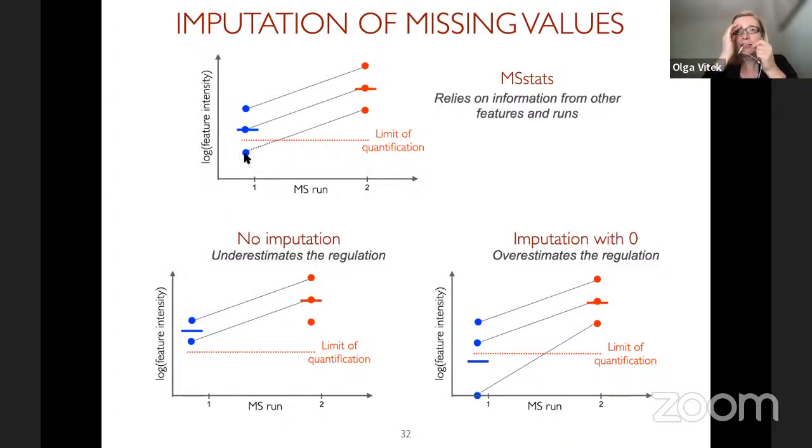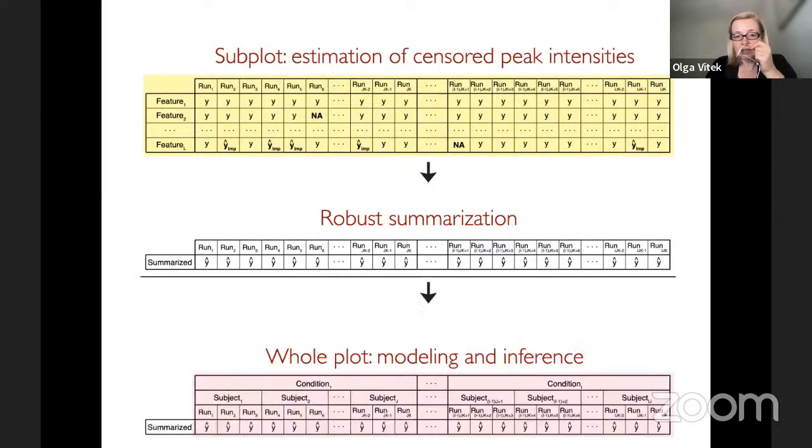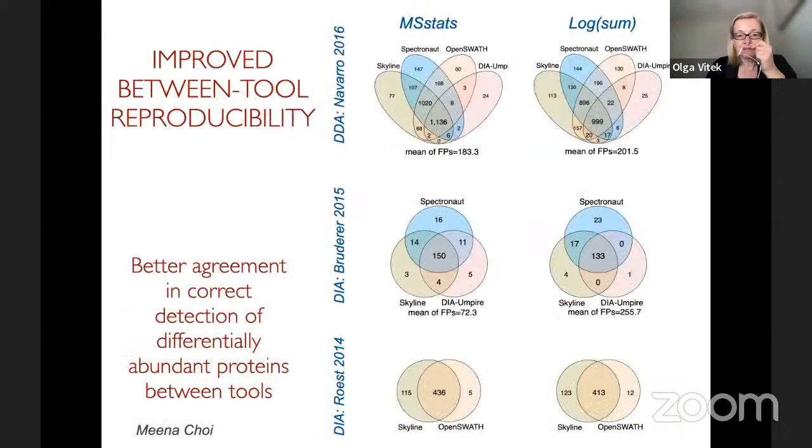As I was saying earlier, MaxQuant is very generous with missing values, so those missing values may come from other situations. Well, we always have the option to just leave missing values as NA, in which case we will have something like this. I would say more work is needed, especially for these more recent workflows and PTMs and so on. So we will certainly be working on that. For now, this type of imputation is an option. So you can use it or you can leave it out if you would like.